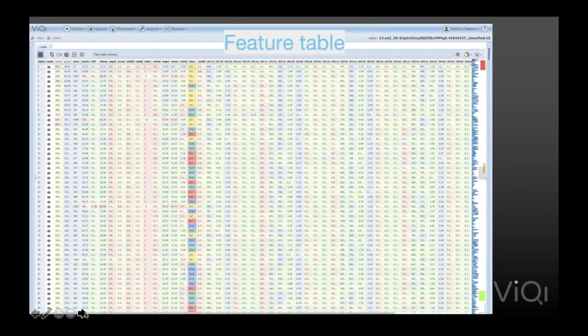Also, you see here that highlighted towards the middle is the class column. So the class column is the other very important input into the AI. And this is called different things. Typically, either the class or the label is also sometimes used as the name for this. This is your target. What are you training the AI to do? You're training it to predict the class, right? And because this is supervised learning, to do the training, you're giving it which set of columns for a given row correspond to a particular class that you've labeled, right? And so those together are given to the AI.